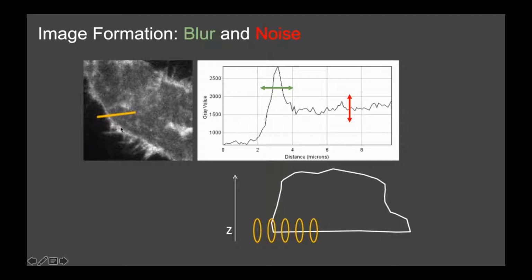So for example, if you look back at the image of the cell, you see at the edge of the cell, the signal looks brighter than at the center. Now if you're not very experienced, you might conclude that this protein is maybe specifically or more enriched at the edge of the cell. But if you know a bit about microscopy, you realize that because of the anisotropy of your point spread function, there's just more membrane fitting into the little volume that you image at the edge than at the center.